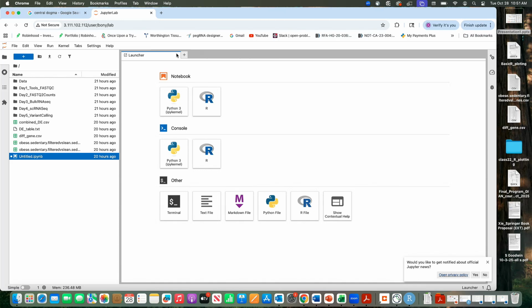So yesterday Manpreet sent a series of files. There is a Word file, and then there are a couple of CSV files and a .text file. Okay, so what are we going to do?